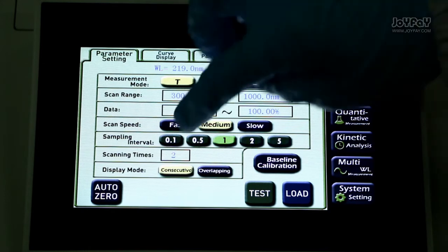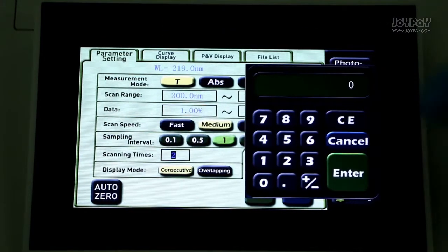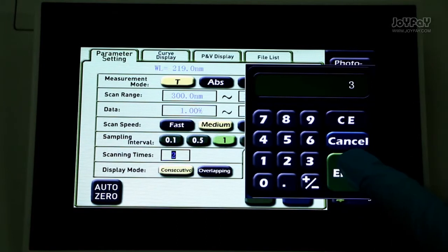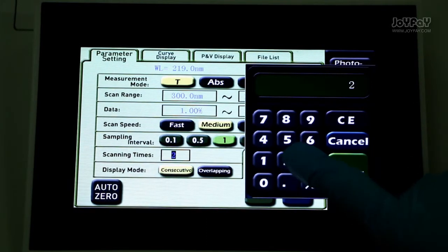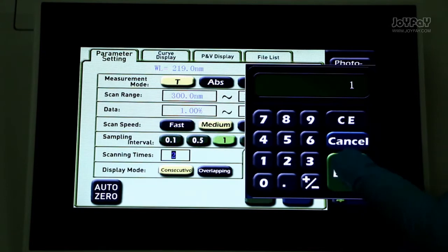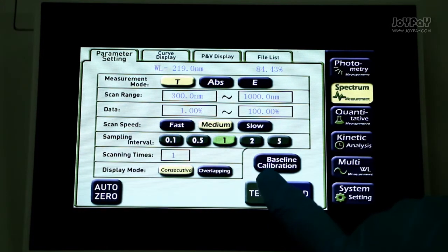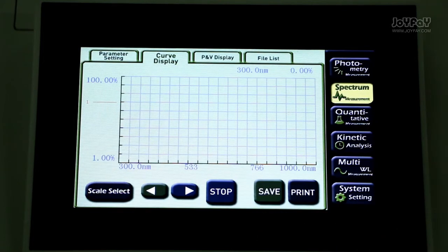You can set scanning times according to different requirements. Click the input box after scanning times and input 1 to 3. I will enter one. Press test. The screen will move to the second tag.